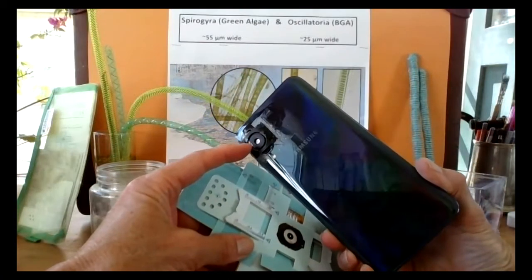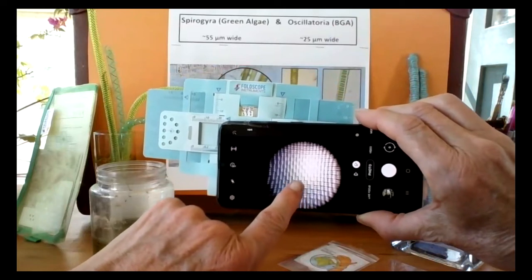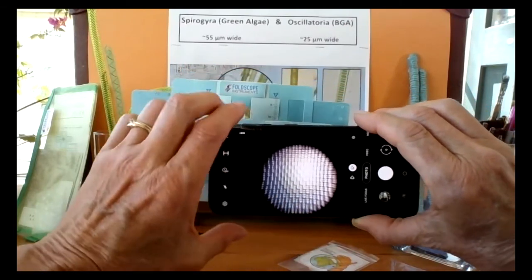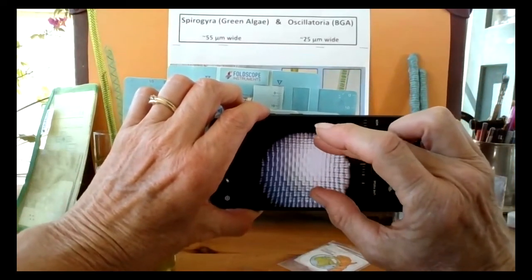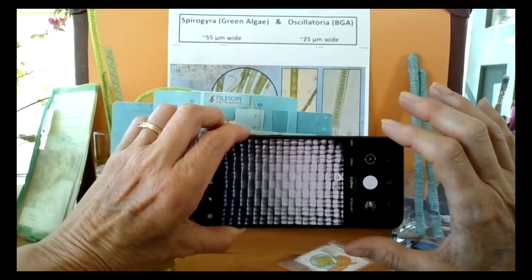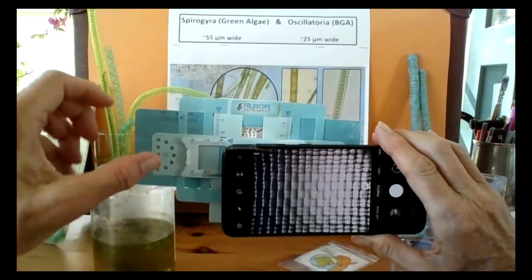Coupler on my phone so that when I place it over, it lines up, and as you can see, my phone now has an image of the micrometer mesh for the purposes of measurements. Just to give you an idea of how to focus, something to focus on, and also to give you an idea of sizes when looking through your foldscope.